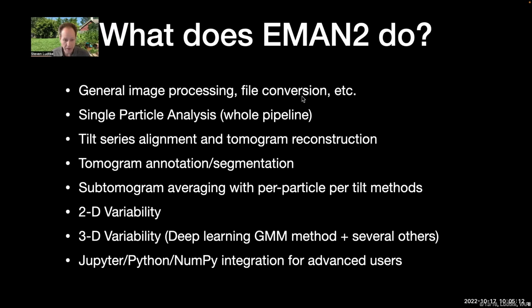If you know a little Python, you can do even more with it, since it has a nice integration with Python and some integration with Jupyter Labs. We've got some online sessions already on YouTube, which talk about that, and we've been meeting every week to talk about the Python aspect of things. But there are also plenty of command line tools for doing that sort of thing. We can do the whole pipeline of single particle analysis. That's a tutorial you're going to go through in the next week.